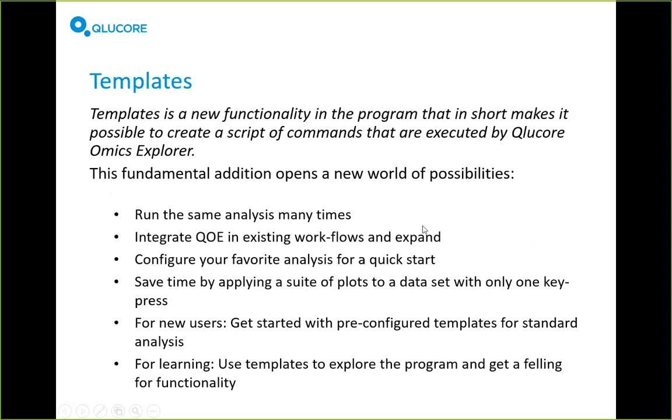One thing I use templates for at the moment is that I often bring up a few standard plots. I bring up a heat map, maybe 2 PCA plots, and a few other things. I've written templates to do that for me. So what I can do is take my data set, load it, and then just call that template, and boom, I have all the right plots on the screen instead of having to open them manually. Saves me time. It also makes things repeatable for me.